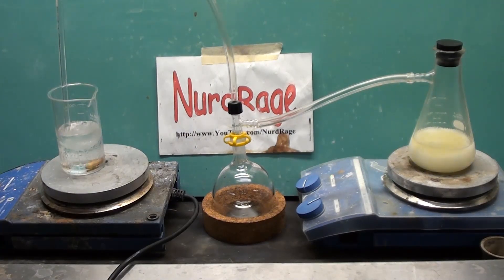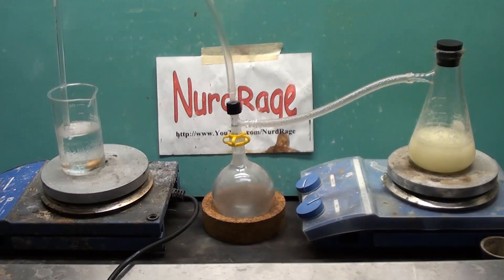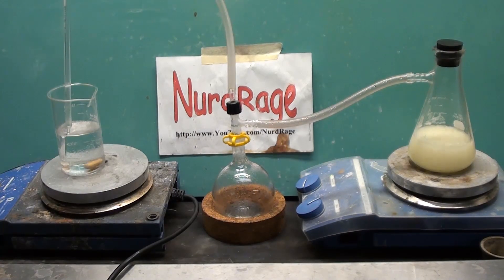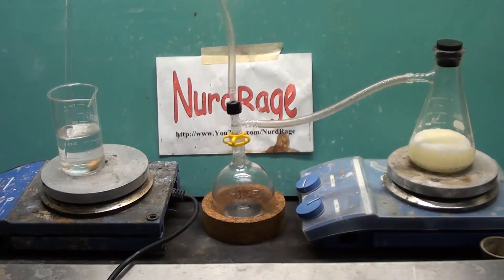Eventually the generator will stop making gas, but due to the high solubility of hydrogen chloride, the water might pull back into the tube and quickly and dramatically backflow through the system as it tries to absorb more gas. This can come as a surprise and you should have a method to deal with that like I have here. The backflow is happening and it's going to go out of control right about now.